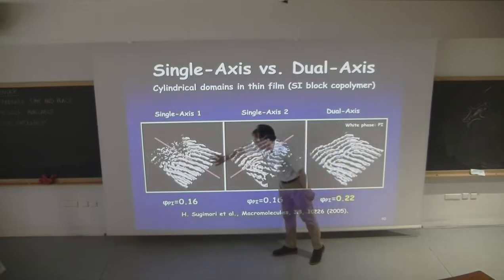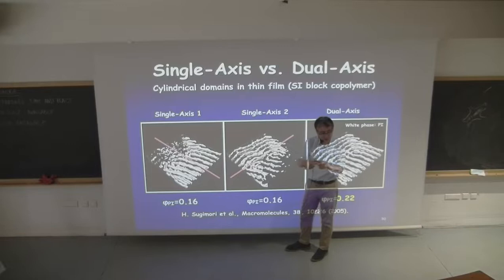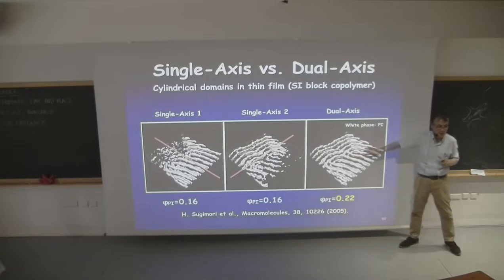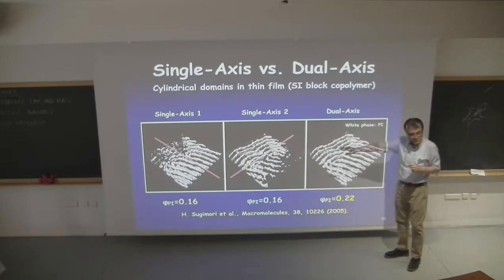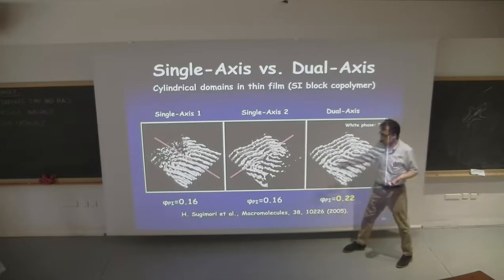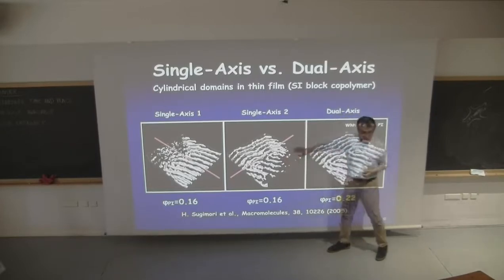What we do is take electron tomography once, and then we change the sample inside the TEM. I mean, we change the direction of the sample, and then we tilt it again at the same position. We take two datasets and combine them. Then we can have a complete set of data. It's very tedious. But when we did that, in 2005, it was more than 15 years ago. Since then, electron tomography has become widely spread, and people can use it. There's software available, and you can ask a microscope company. You can have an option of doing electron tomography. But unless you know this kind of problem, you may misunderstand the result. So please be aware of this.